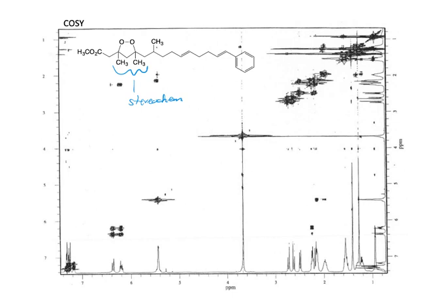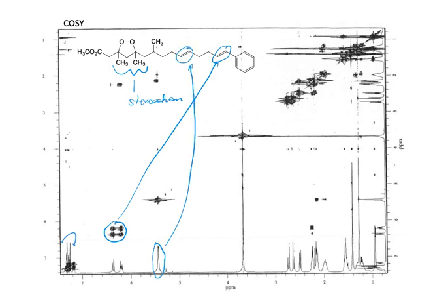Okay, so we can just look at this COSY. We could pick out a few things, I guess. So here are the aromatics down here. These 2 protons are going to be the protons for this double bond here. If we look up here, we can see this looks like a diastereotopic pair of doublets, right? Because they're slanting towards each other like this.